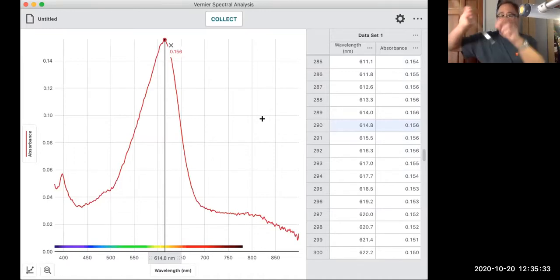I want to have a tool for measuring how much solution I'm going to put into the test tube. And I want to have two of these, one for the colored solution and one for the standard solution that has the same pH as the colored solution. To use these, I use a pipette bulb to draw a solution into it, read the measurements here, and put it into my test tube, and then I'll mix it.